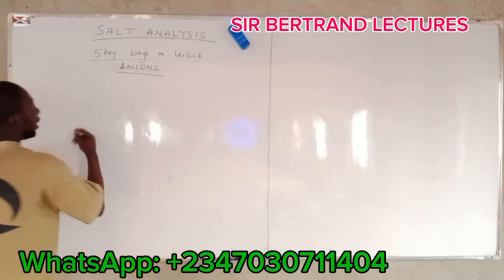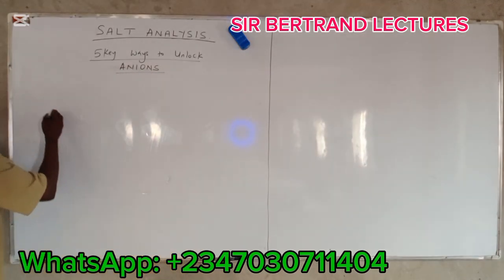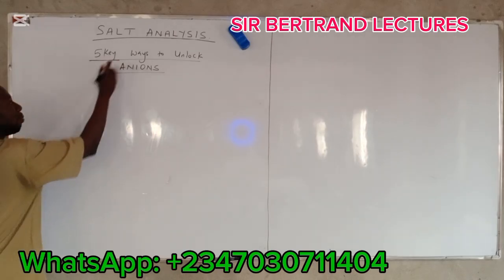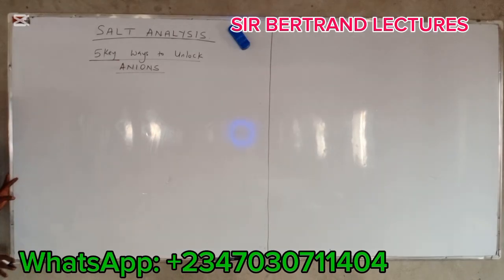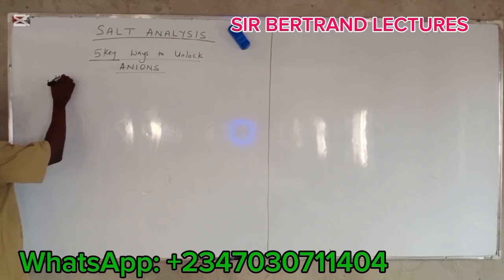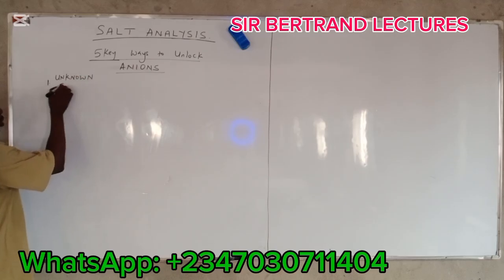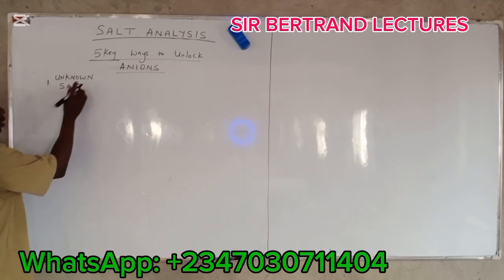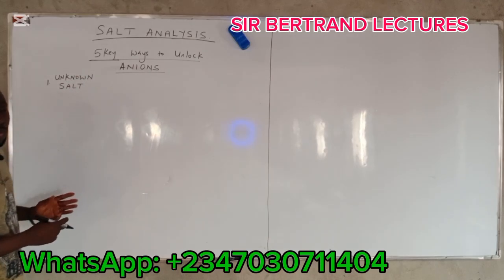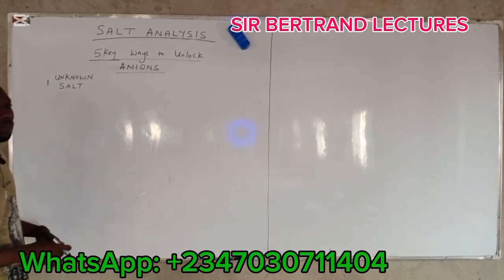Now, let's look at the first experiment used to unlock the anions in a given salt sample. I said there are how many in number here? There are five in number. They are number one. You have here an unknown salt. We are trying to find out the anions that are present.